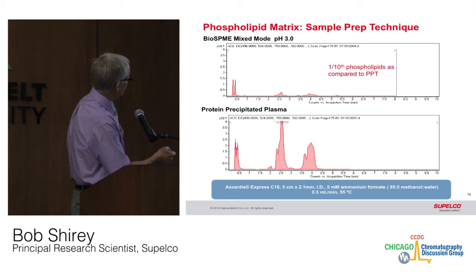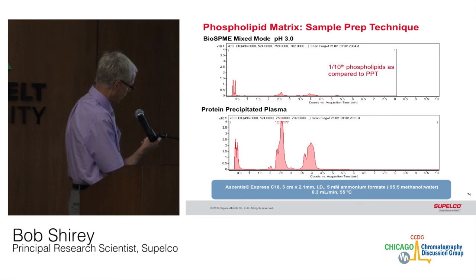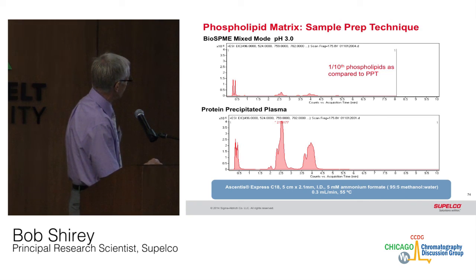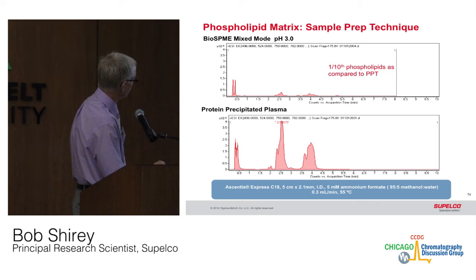It's further enhanced by the fact that the BioSPME repels phospholipids. You can see that monitoring for phospholipids, there is much less shown with the fiber versus those where the protein was precipitated. You still have a lot of phospholipids remaining in the supernate.